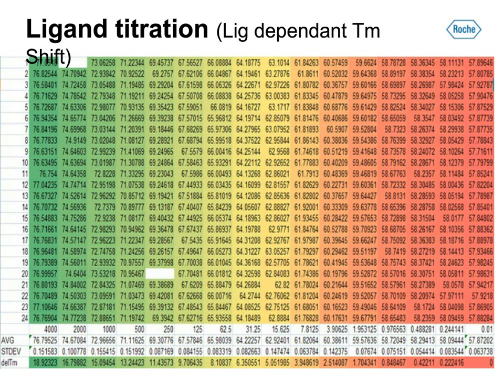And with the help of the 480 data, we wanted to extend this and see if we can record these kinds of events on a 1536 instrument. Remember, the 1536 instrument has 1,536 reactions to be run within the 10 minutes time span. And the volume of these reactions is also pretty low. So it was a very interesting experiment to do.